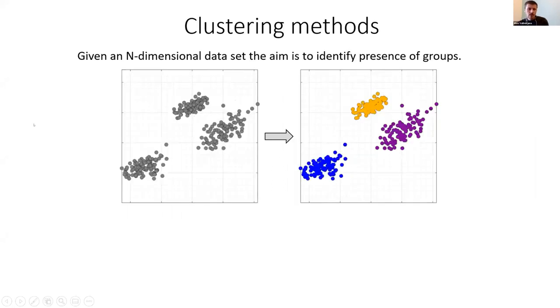So, clustering methods. Clustering is a family of machine learning techniques that deals with solving the problem of, given some data, attaching a label to each of the points so that they form clusters. So basically the task is to group your data automatically. The other big family of machine learning techniques is the classifiers, which, given a new point and a set of labels like we have here, in this case the colors, assign one of the given labels to the new point.